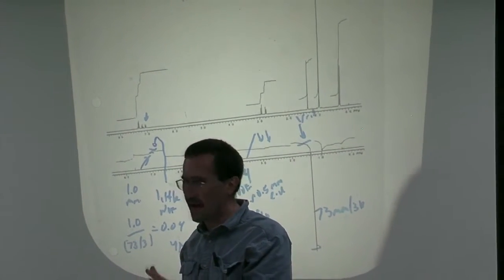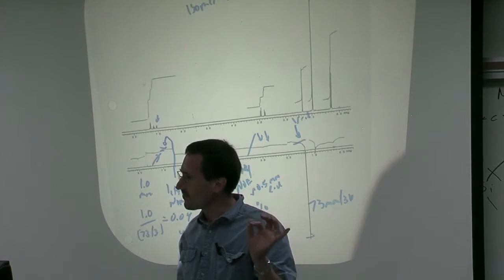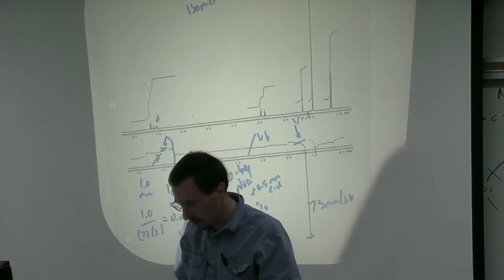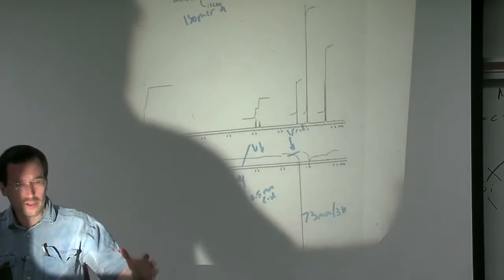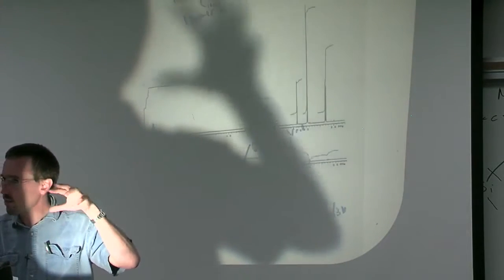Even though I wanted the isomer in which the methyl group was cis to the hydrogens, there was enough data saying it isn't. In fact, there's a good deal of data saying it's trans to those hydrogens. So anyway, be careful with NOEs. Usually we're talking about having multiple data sets, multiple NOEs pointing in a particular direction.